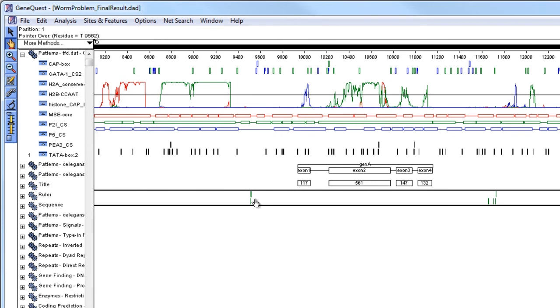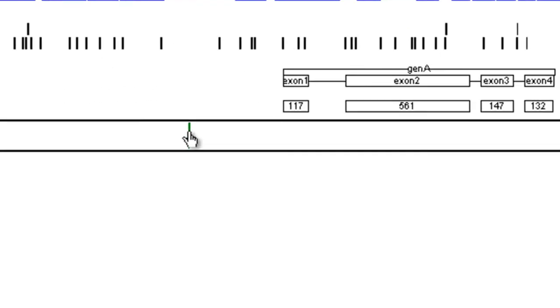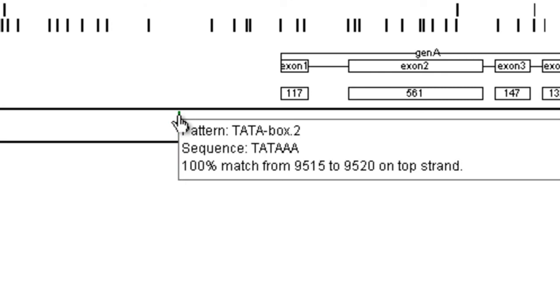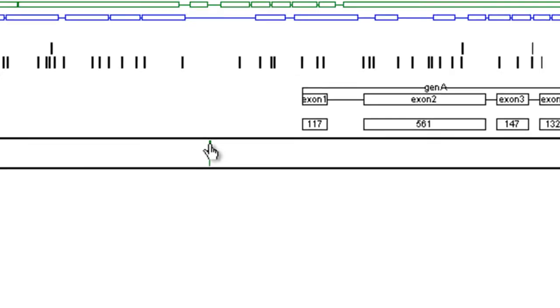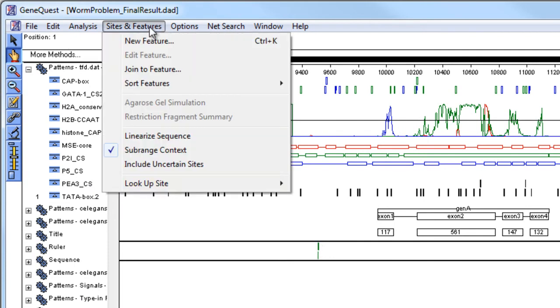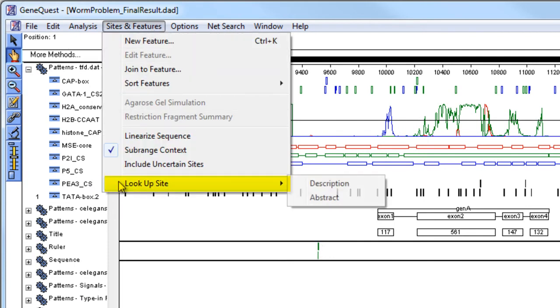To see more information on any of these hits, simply click and hold to see the pattern name, sequence, percent match, and whether the pattern was found on the top or bottom strand.